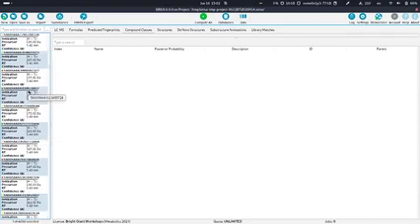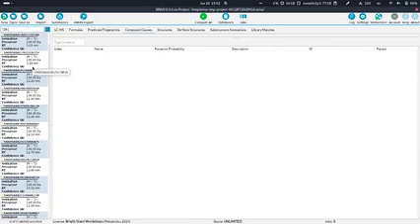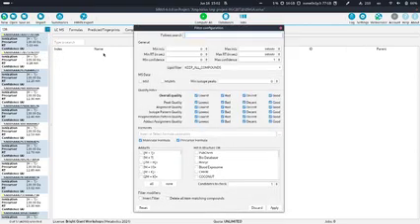What you might even want to do before you do any computations is filter everything you have imported. And to do filtering, of course, I said it already, you can type something in the search field, for example, the name of a feature, but you could also, for example, type a mass. For example, to get the first compound, I could also just type in 139 and point, and I would get all the compounds which have a mass of 139. But let's do actually some more useful filtering.